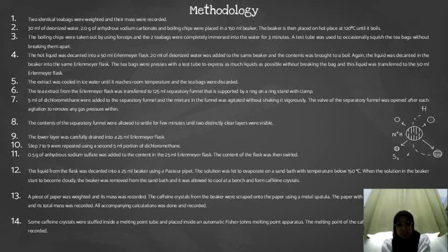When the solution in the beaker started to become cloudy, the beaker was removed from the sand bath and allowed to cool on the bench to form caffeine crystals. A piece of paper was weighed and recorded. Then the caffeine crystals from the beaker were scraped onto the paper using a metal spatula. The paper with the crystals was weighed.